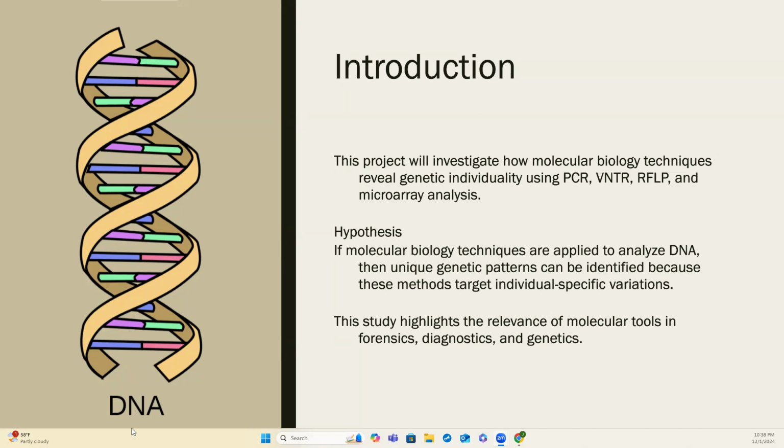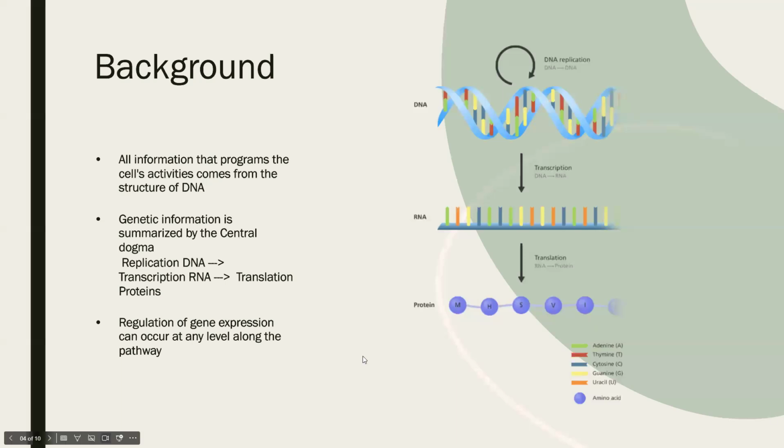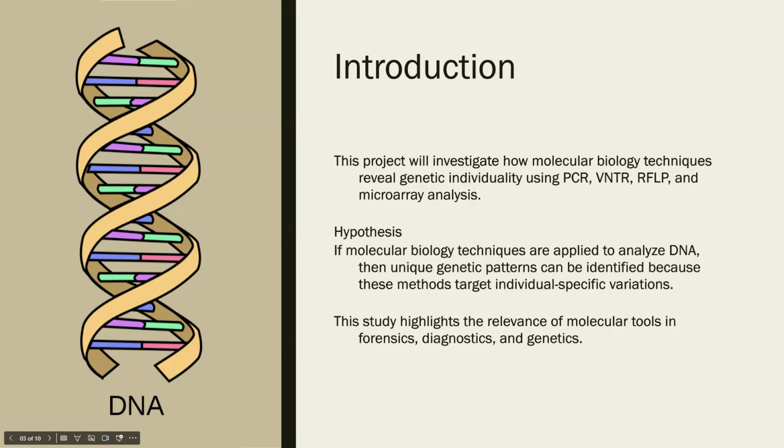Our hypothesis is if molecular biology techniques are applied to analyze DNA, then unique genetic patterns can be identified because these methods target individual specific variations.